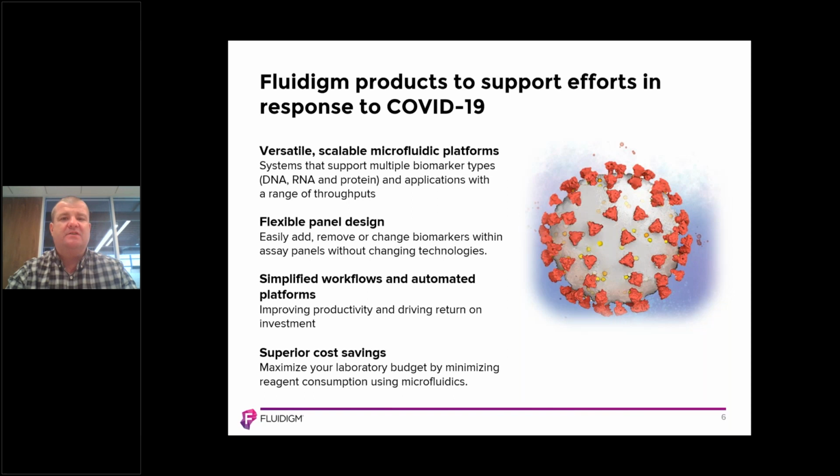If you recall from last week's webinar, we mentioned that you can add and remove assays on the fly. This objective is key to being able to scale any technology and being able to get a more comprehensive view of what is happening at the pathogen level per sample.